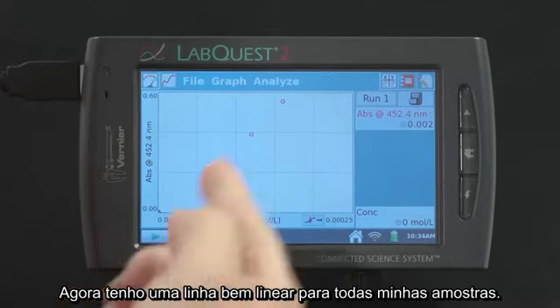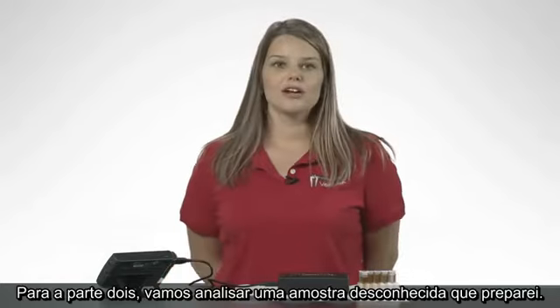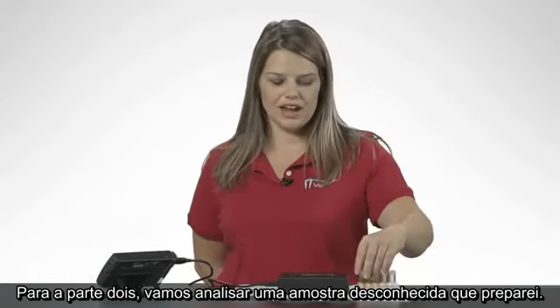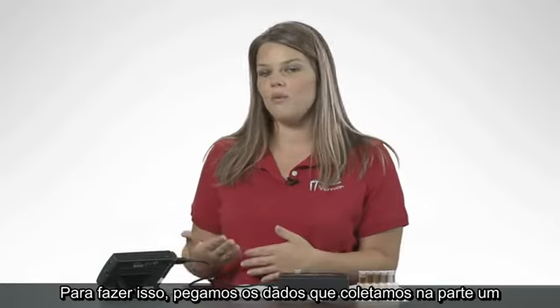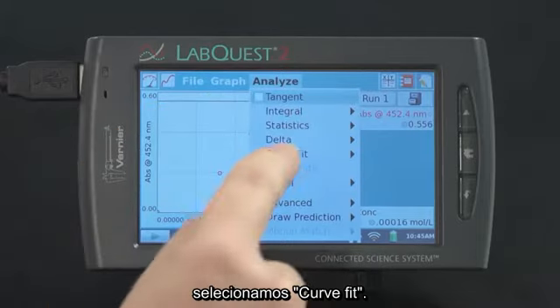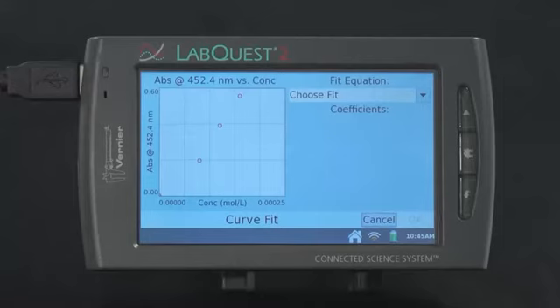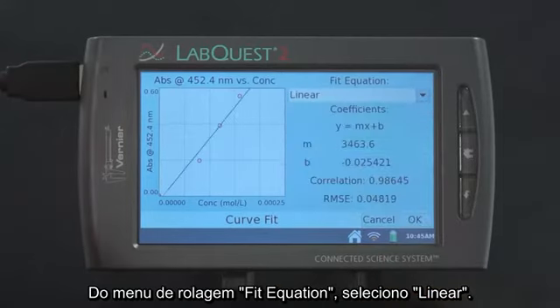And now I have a very nice linear line for all of my samples. For part 2, we're going to analyze an unknown sample that I've prepared. To do that, we want to take the data we collected in part 1 and fit a linear equation to it. From the Analyze menu, we select Curve Fit, and then select the data. From the Fit Equation drop-down menu, we want to select Linear.